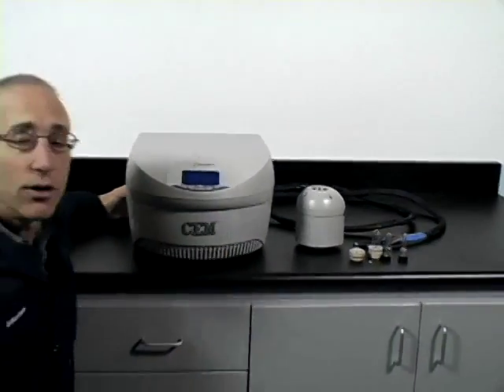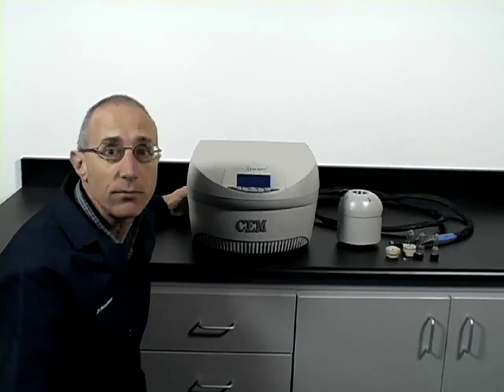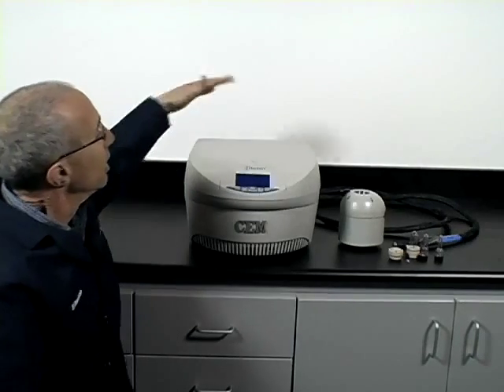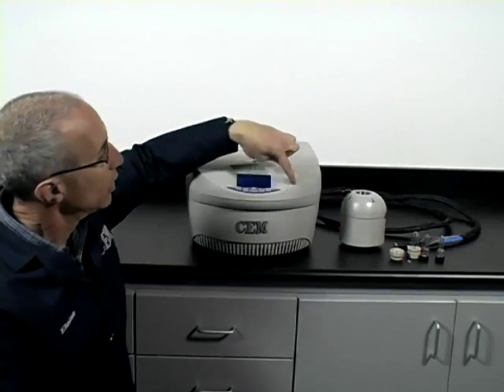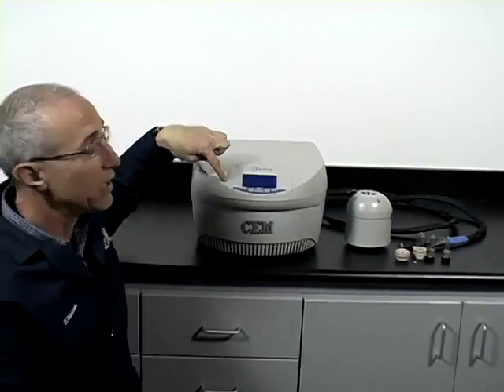Then you've got your microwave generator controller. This will sit external of the glove box or the hot cell. This houses the power supply and microwave generator. The controller features a display and keypad.